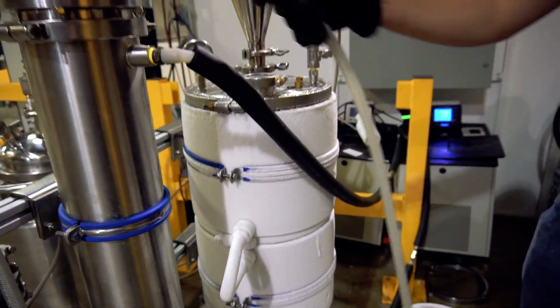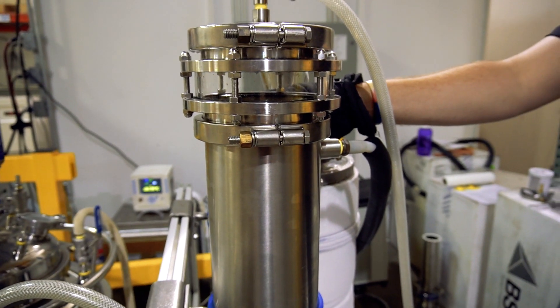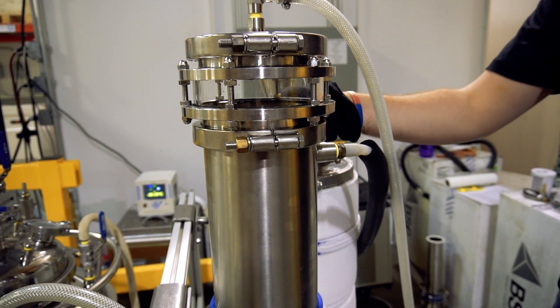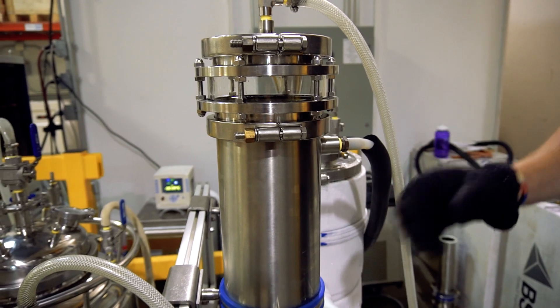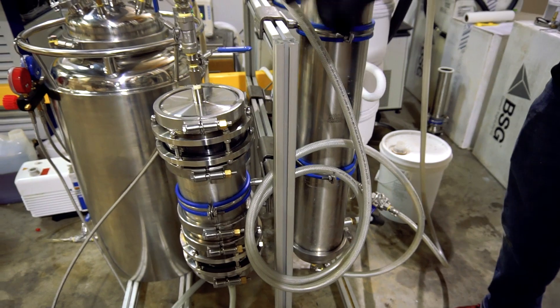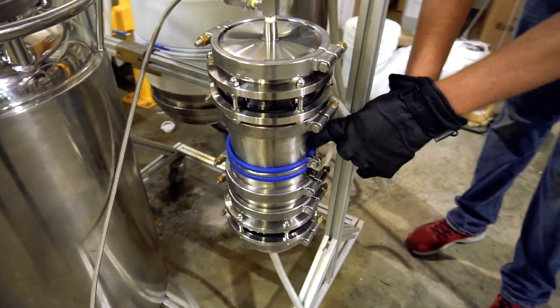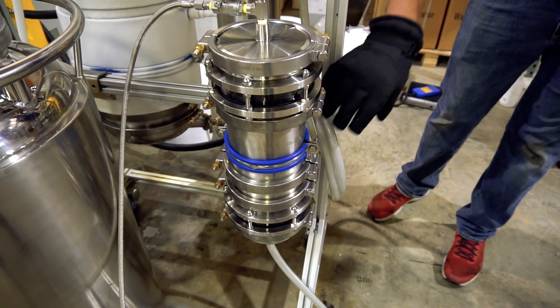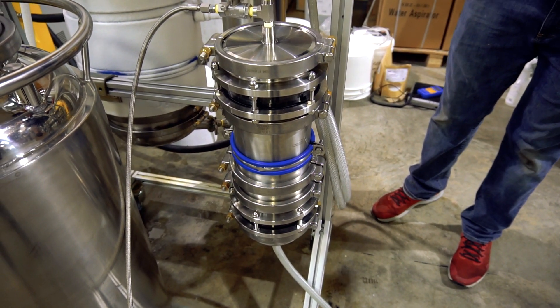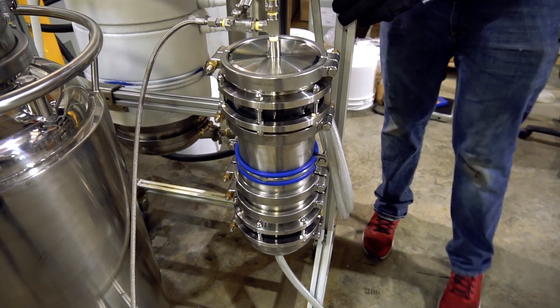It will be transferred through this hose to the shotgun condenser right here. The shotgun condenser is set to 60 degrees Celsius — it's going to bring the temperature of our material up, and by the time it leaves the shotgun condenser it will be ready for a hot scrub through this column, which is packed with activated carbon as well as mag sill.